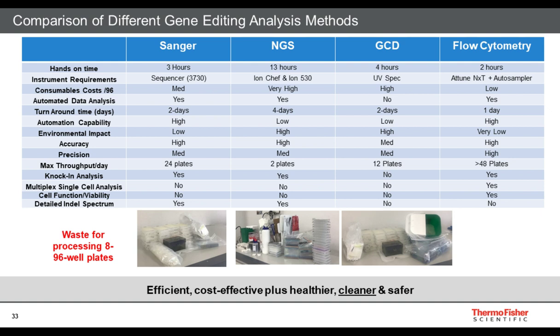As far as environmental impact, flow cytometry is very nice because, again, it's just the reagents and the consumables to run the instrument, as well as what other antibody you may need or what other plates you require to analyze. You don't need a lot extra.